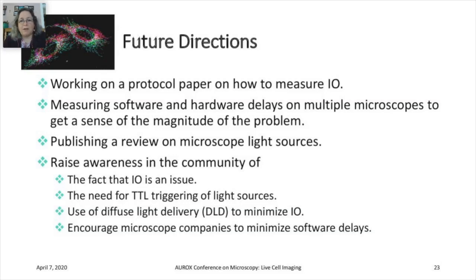We're publishing a review in Microscope light sources, so we're going to try to really give people a sense of what's out there on the market and what are the pros and cons of the different options. And then as today, we're going to try to raise awareness in the community. I know we were aware that illumination overhead was an issue, but I definitely didn't appreciate the magnitude of the issue. When we had set up our microscope, we thought we had set it up for the TTL triggering, but it turned out that this USB connection to the microscope was actually causing this additional delay that we were unaware of.